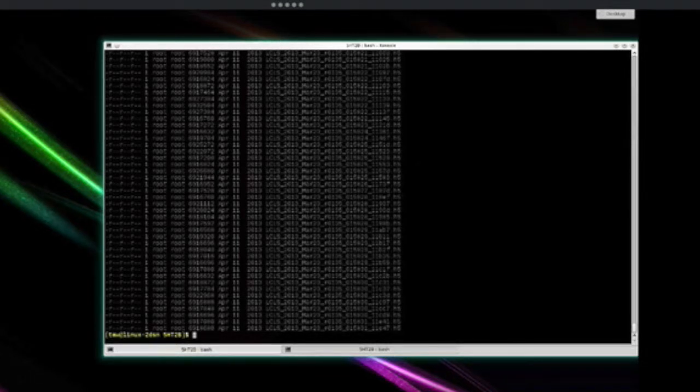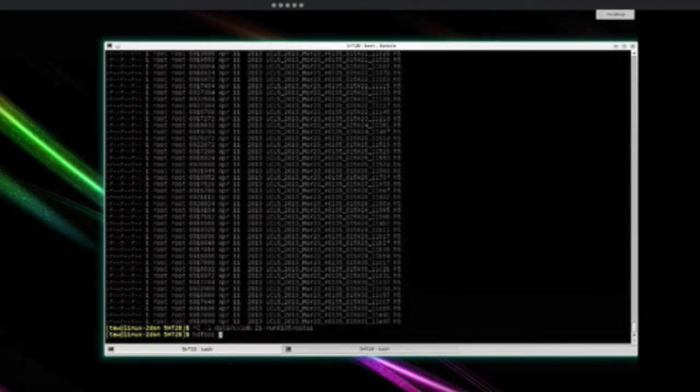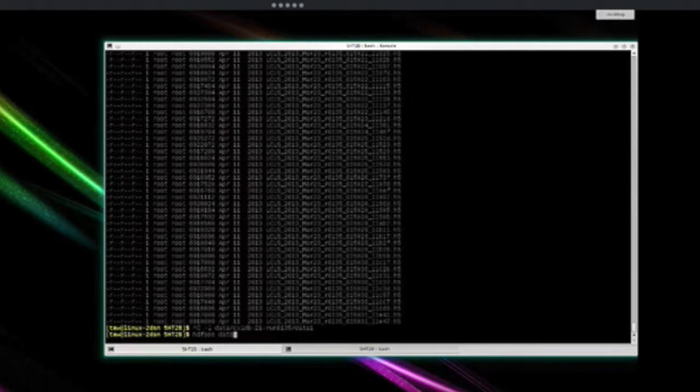So let's use the CrystFEL program hdfsee to look inside one of these. So hdfsee, which is the CrystFEL image viewer. You can look in data/CXIDB, let's go to data1.